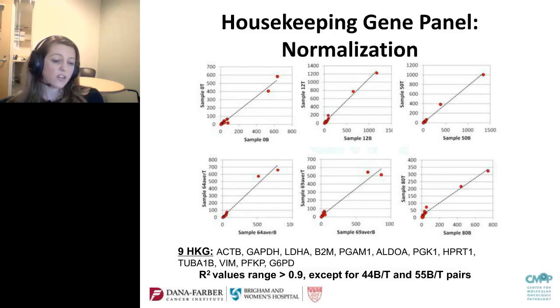Initially, we had thought that using a global normalization strategy for this QC would work, but based off this and the fact that we had suboptimal results, we decided to use a normalization strategy for each of the individual samples in and of themselves, and then apply a global normalizer afterwards.